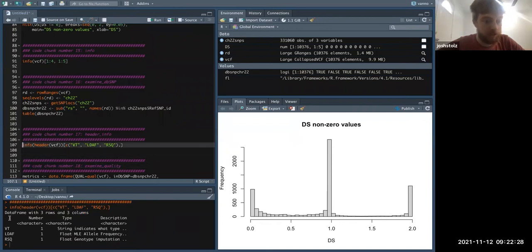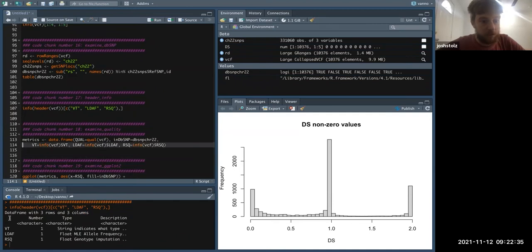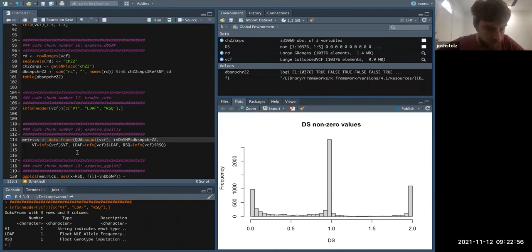Unannotated SNPs tend to have a bias for being less studied, and it tends to be less reliable in some sense if it's less known. So we can investigate that here to see if our annotated SNPs are more accurate than our unannotated ones. We're going to take this info field and take the quality score of every SNP in dbSNP. VT means variant type.